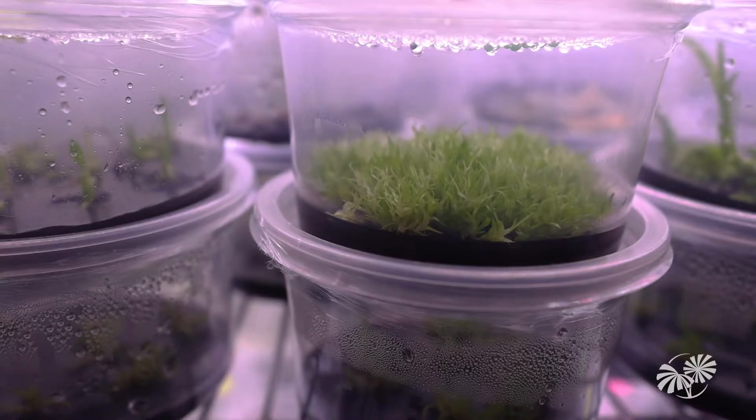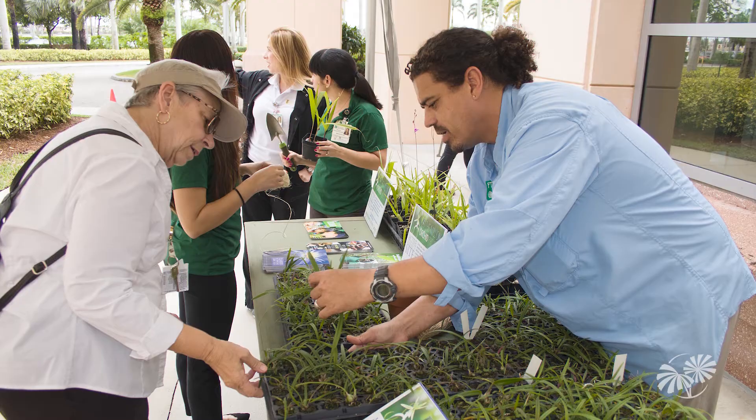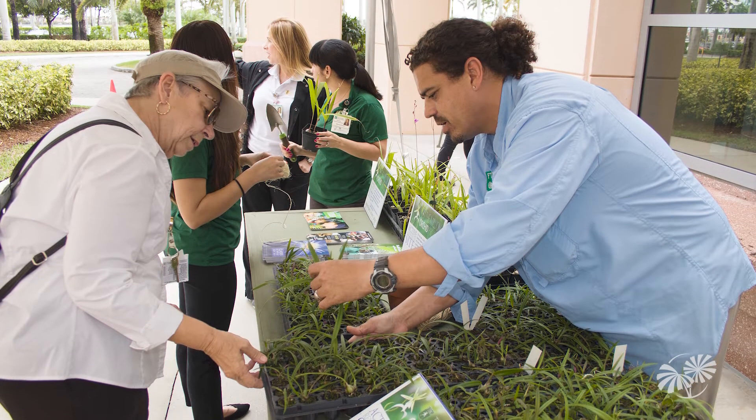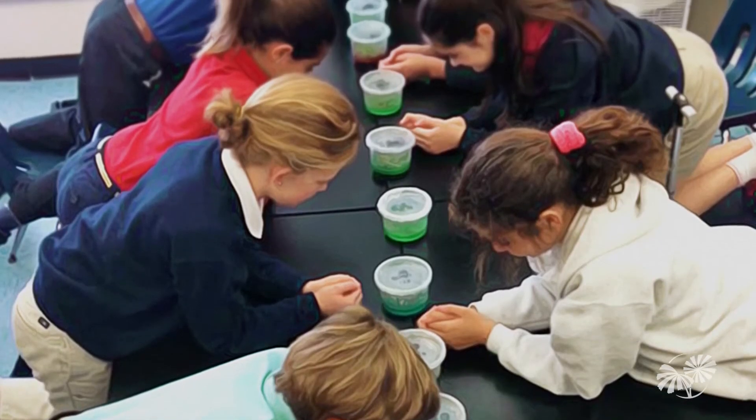In addition to propagating orchids here in the micropropagation laboratory, we also participate in a whole host of research experiments and projects to help us further our conservation actions, one of which is learning more about seed banking and seed banking science.